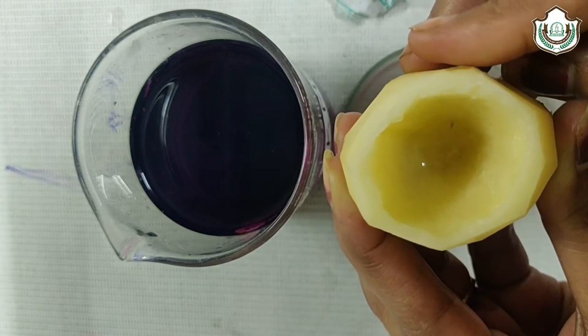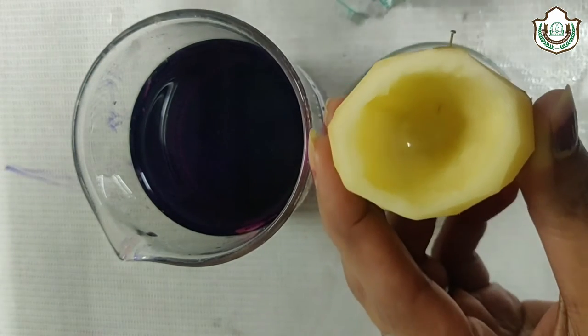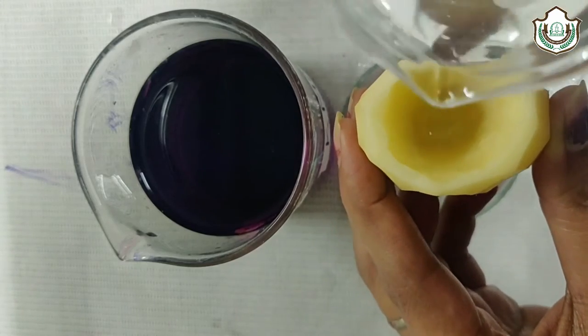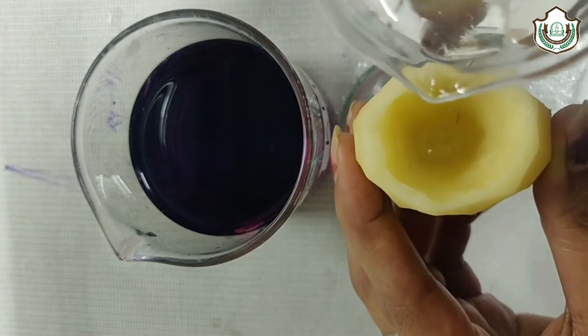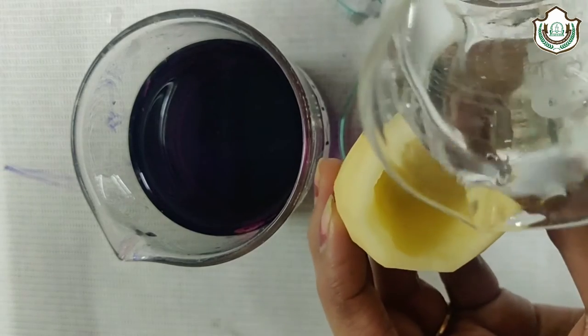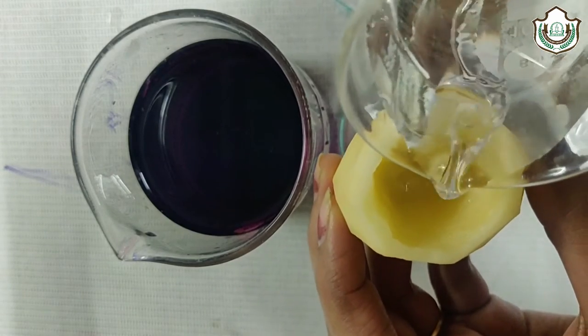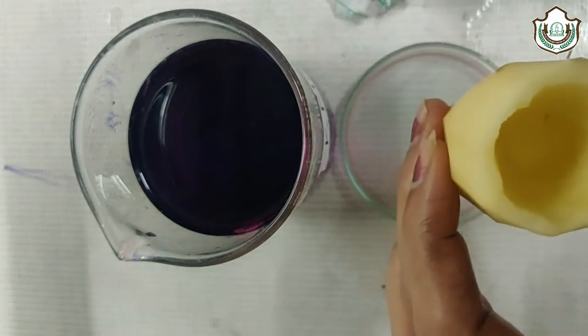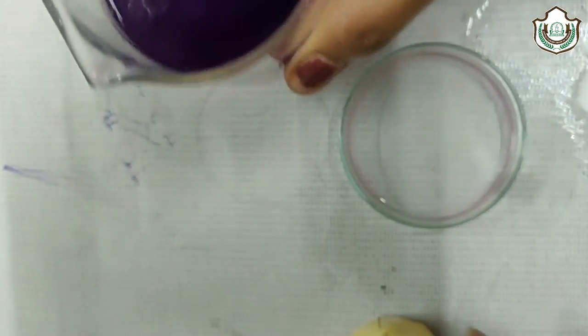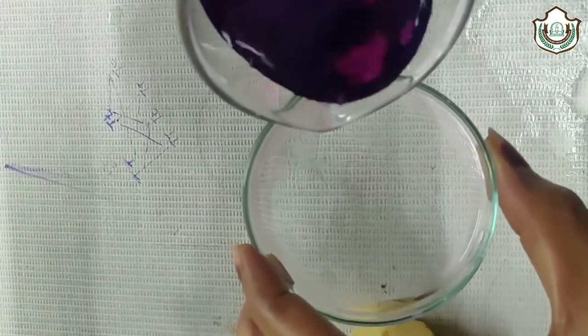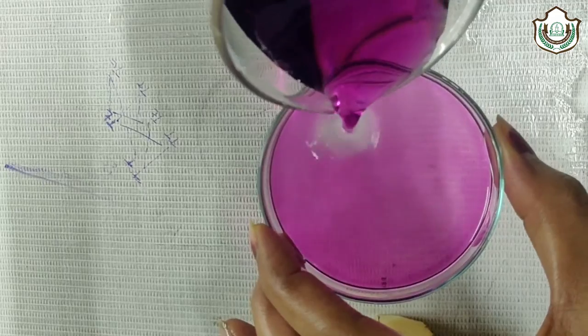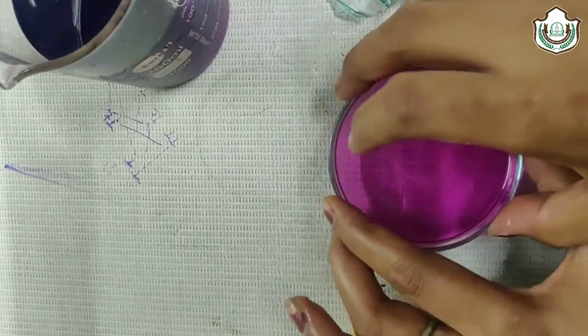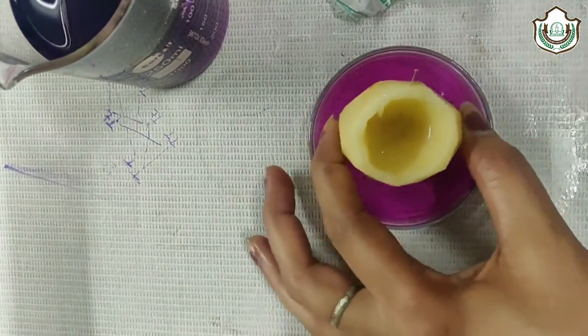Like this. Then we will fill the 10% sucrose solution till the mark of oil pen, like this. And in petri dish, we will fill the potassium permanganate solution and place our potato osmometer in it.